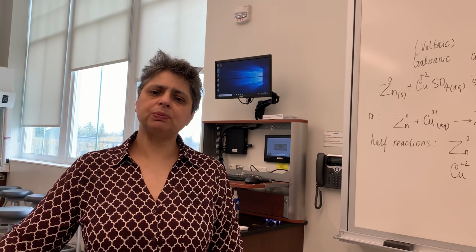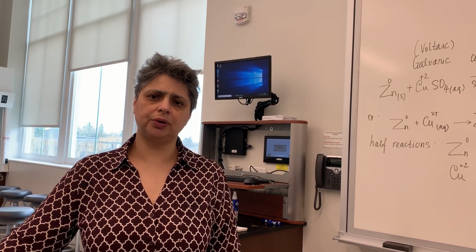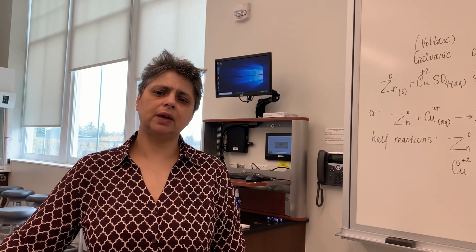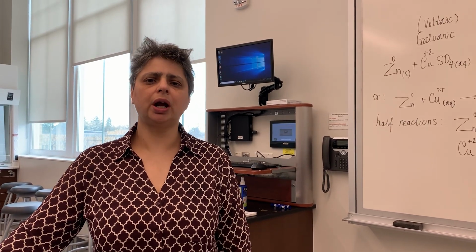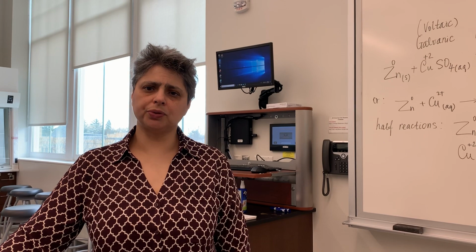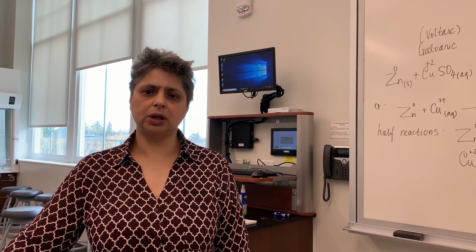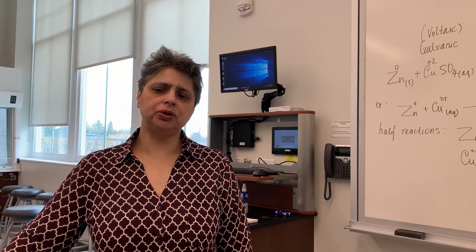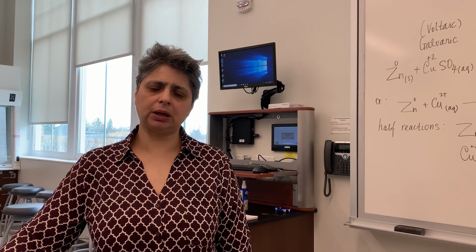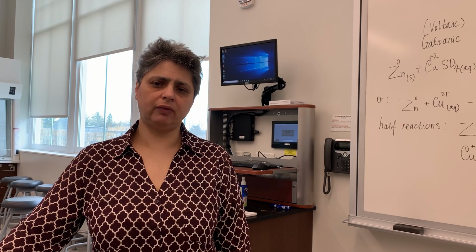So for this lab, it's more or less a demonstration. You will have to fill out the data sheets that's in your lab manual. We'll talk about it towards the end of this pre-lab lecture, but you will not have to do the post-lab. And you will record observations from what I'm going to show you. And in this lab, we're basically going to demonstrate to you what a galvanic cell might look like and how you measure voltage generated by such a galvanic cell.